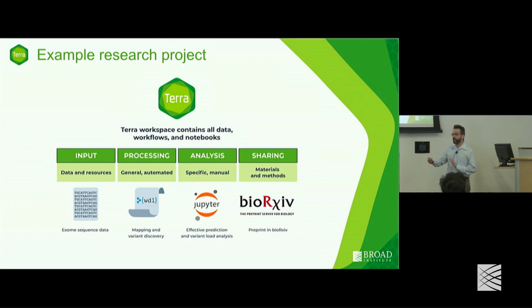Once you have done all of the processing, so any alignment, any variant calling, any type of additional filtering, at that point you have data that's ready for some sort of clustering analysis, for example. And conveniently, inside of the Terra workspace, you can actually interact with the data directly using a Jupyter Notebook, which is what we'll learn about.